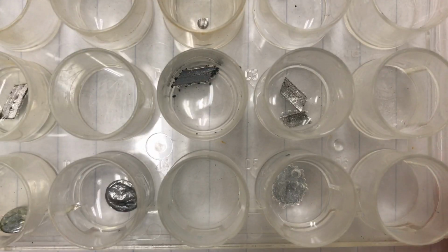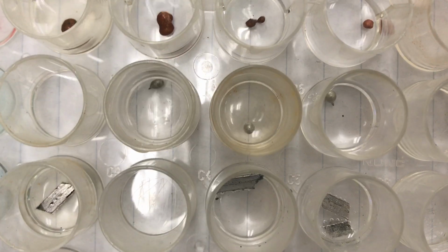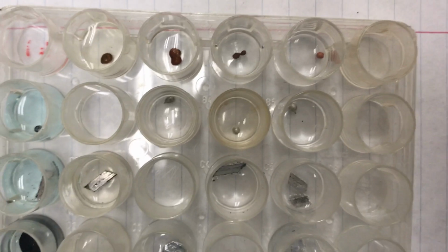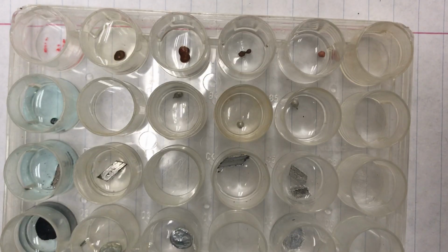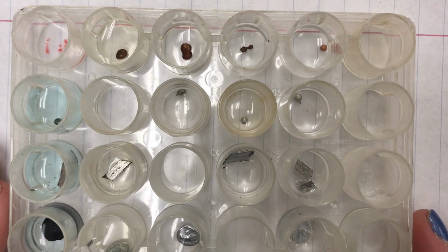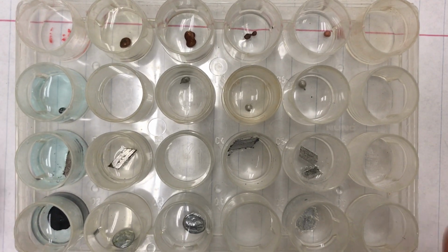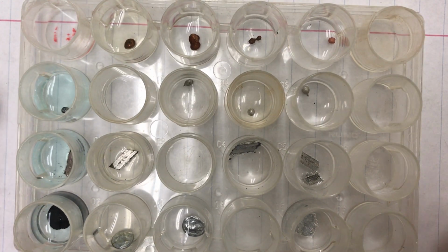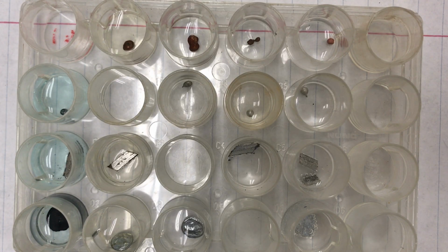All right, so you need to remember now to use this data, make sure you fill out your data table and use that data to answer your questions. On page 3, don't forget that we added question 5, which is for any of them where a reaction occurred, so you could see a sign of a chemical reaction that we just talked about. You are going to write out the reactant side of the chemical equation, including the states of matter.